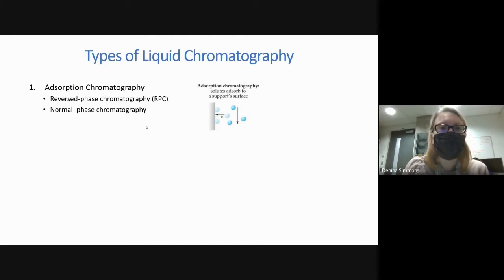So let's talk a little bit more about the types of liquid chromatography now. I've given you the basics: definitions, why peak shape is important and why resolution is important. That was the first chromatography course I took in a nutshell. In about 20 minutes, I just explained a whole year's worth of chromatography from when I was an undergrad. My second chromatography course was all about this stuff: the types of adsorption that you can play with in order to get different types of separation.